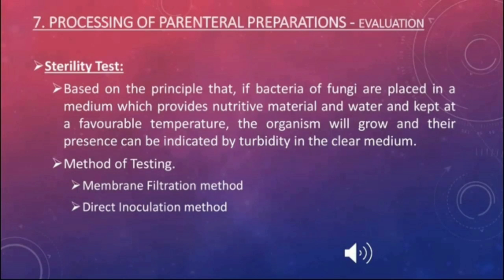First one, no evidence of growth, hence the preparation being examined passes the test for sterility. Second one, there is evidence of growth, so retesting is performed using the same number of samples, volume to be tested and media as in the original test. If no evidence of microbial growth is found, the preparation being examined passes the test for sterility.